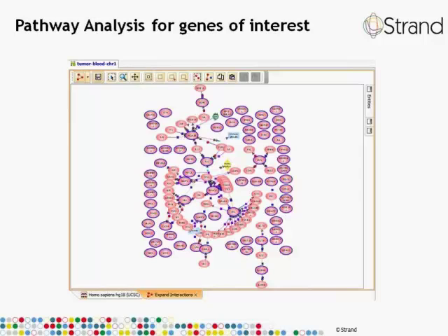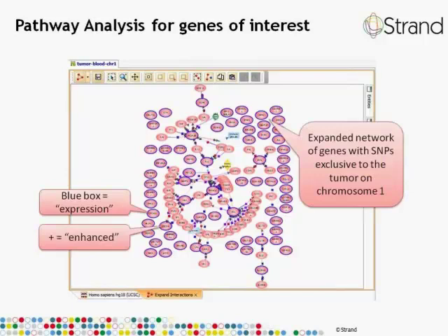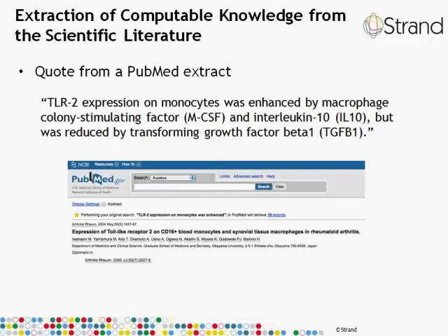These can be extracted using text mining or natural language processing algorithms, and they have been put into the pathway database. At the same time, in Avadis NGS, you can load KEGG and other BioPAX pathways from various databases, search for known pathways, and see which of them overlap your gene list of interest. Here we show you a hypothetical network that's built out of genes from your analysis. The connecting information is developed by text mining.